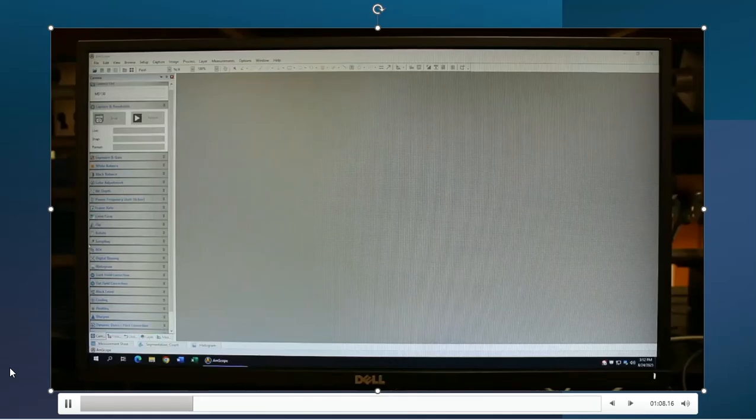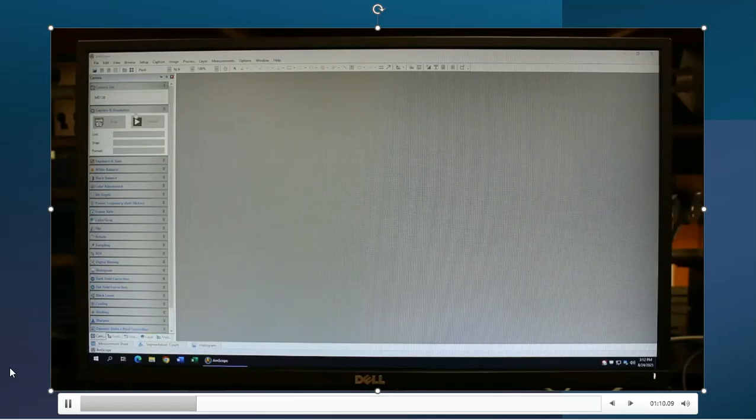Up here in the top left-hand corner, there is going to be a camera list. Right now, there's only one camera in the list, and that is titled MD130. Because that's the only one, that's the one that I need to click on. Go figure. If we had other cameras on other microscopes, this computer can connect to many different ones. But this computer is only connected to one microscope. That's how we like to do things here. So I'm going to click MD130, and then this screen shows up.